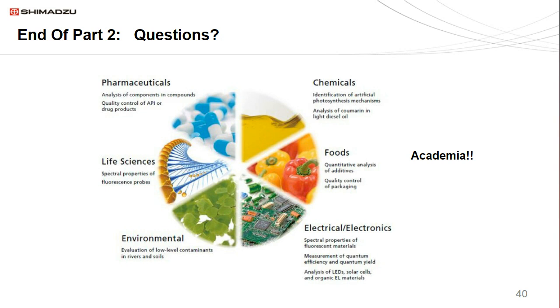Okay. This is because of a unique feature of fluorescence peaks. Fluorescence emissions are not terribly symmetrical. Even if you have only a single peak, you'll notice that the peak tails off into the red. It's not Gaussian in that it has a uniform symmetry. It tends to tail and drag into the red.